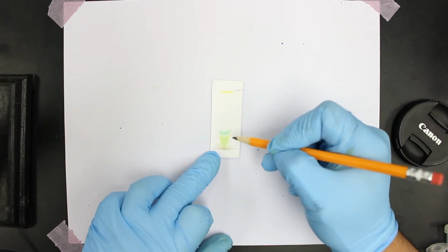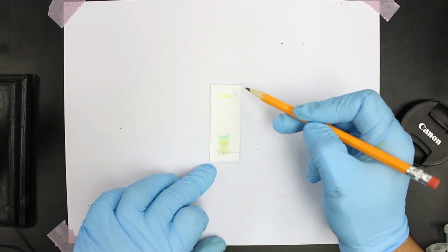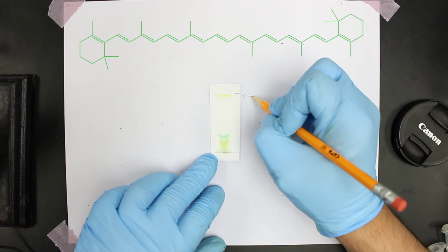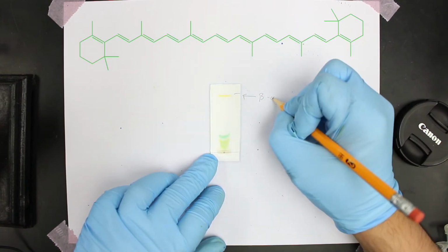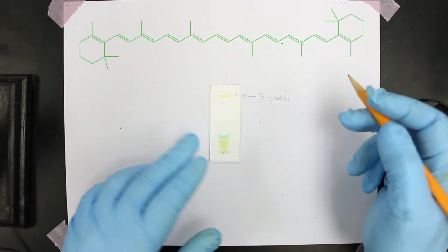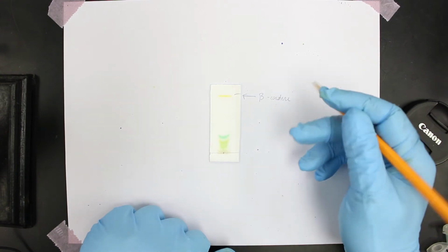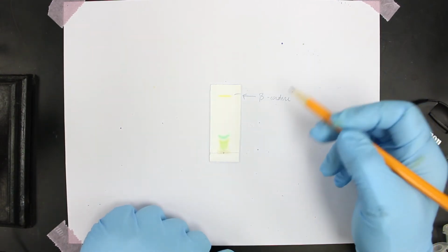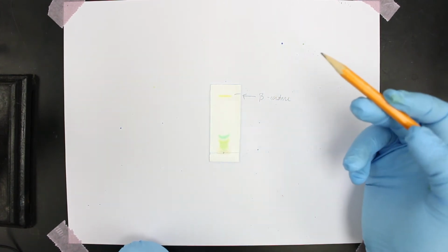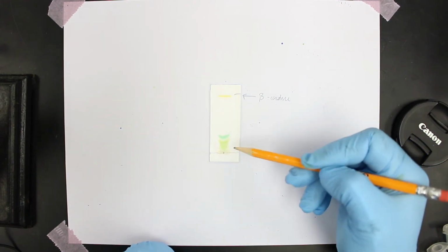Now it's interesting because leaves contain a lot of natural products, as we discussed in the previous lab. Now the top portion, this is very interesting because the top spot is actually beta carotene, which is the pigment that you find in carrots, hence the word carotene. And down here, the green spots and the yellow spots pertain to chlorophyll in their different forms. So chlorophyll is obviously the portion of the leaf that allows the plant to perform photosynthesis. So that's how plants get their energy, and we can see separate those components based on here.